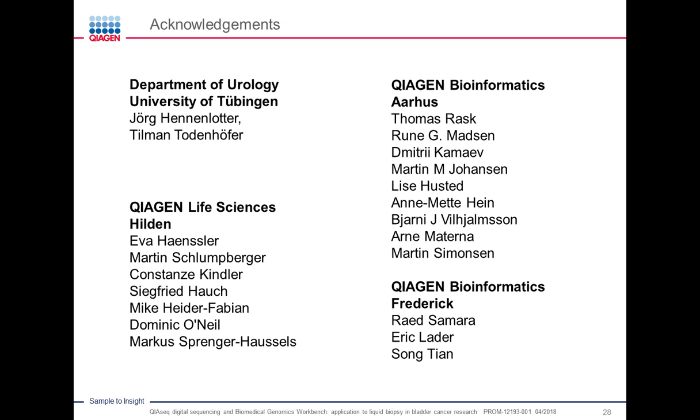The results will be immediately imported back into the Workbench as soon as the analysis in the Ingenuity variant analysis platform has completed. So it's very easy to carry out basic analysis in this way, directly in the Workbench without the need of leaving your desktop application.